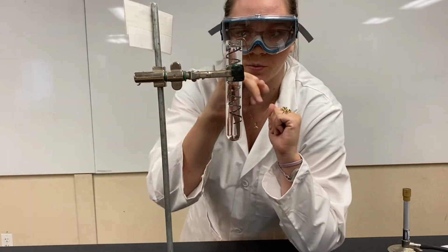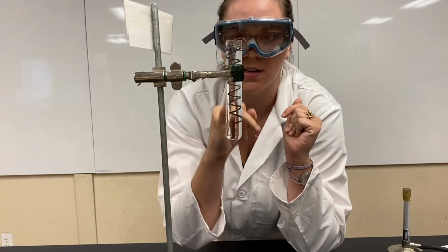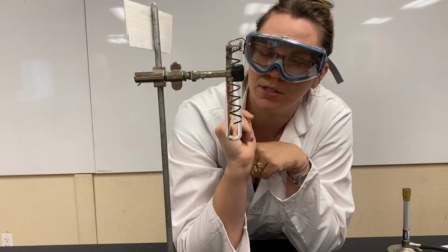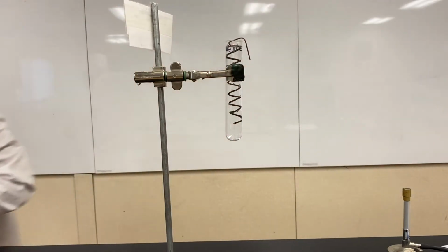All right, so right away you can see the color of the copper is changing. We see that, okay? The color went from the copper kind of bronzy color to this darker color, which is exciting. Okay, I'm gonna try and zoom in so you guys can see. Some pretty cool stuff is happening.